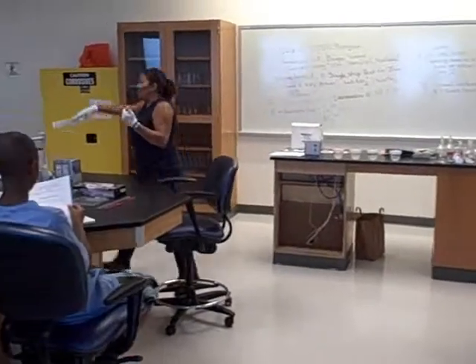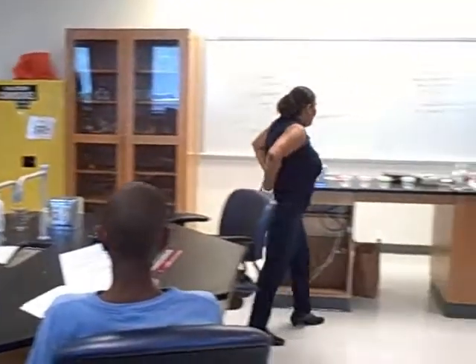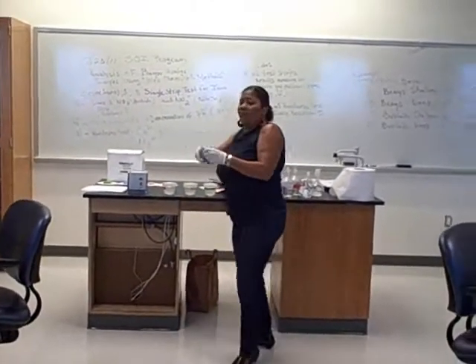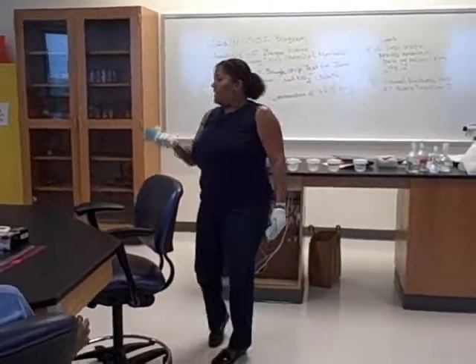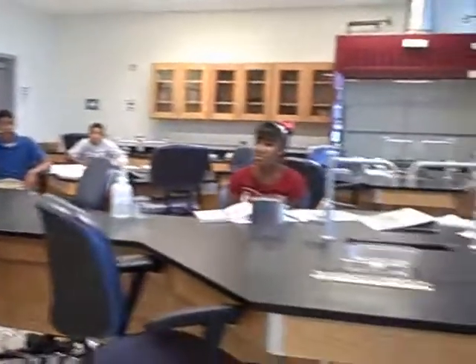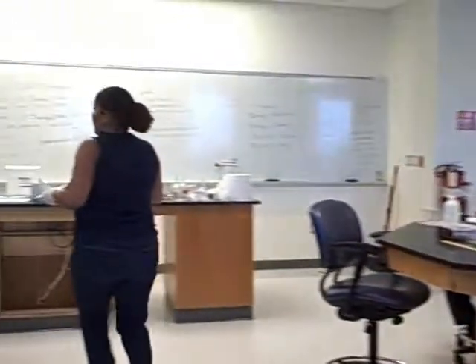Mr. James, please give everybody a pair of gloves. Remember something else that you learned last week. Buck time. Where are my Molucks? Wait a minute, I've got them. Julie, raise your hand and tell me this. What chemical did I add to the samples last week to keep the bugs from eating the toxins? Julie? Acid. Acid, very good. For 2 bucks, what is the name of that acid? Who remembers? Check your notes, go back into your memory picture.